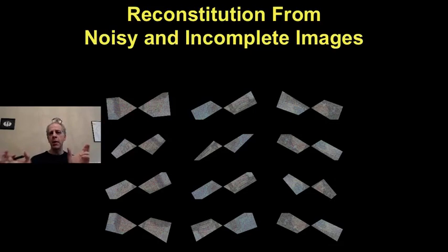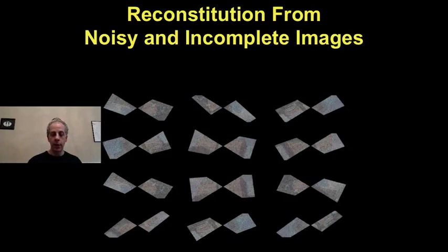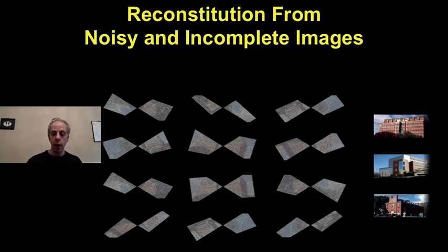If we have 30 degrees missing on each side, we have 60 degrees missing out of 180. That's a lot of missing information, and that's represented here. So these holes are a realistic proportion. You have this, group, align, do everything together, and hopefully after you're done, you're able to reconstruct back the virus or the images as we represent here.